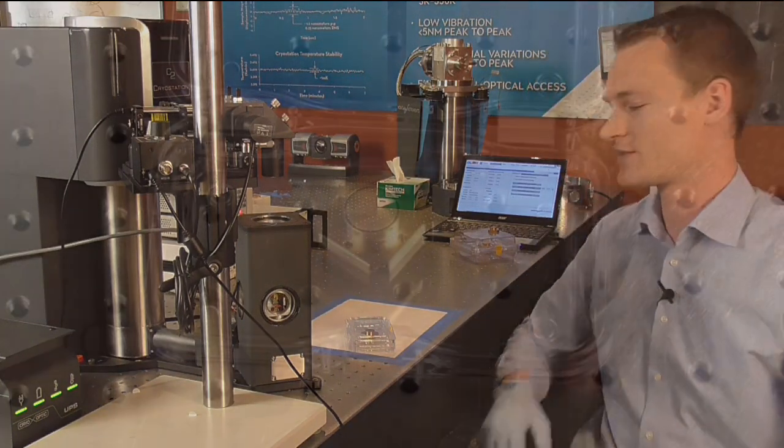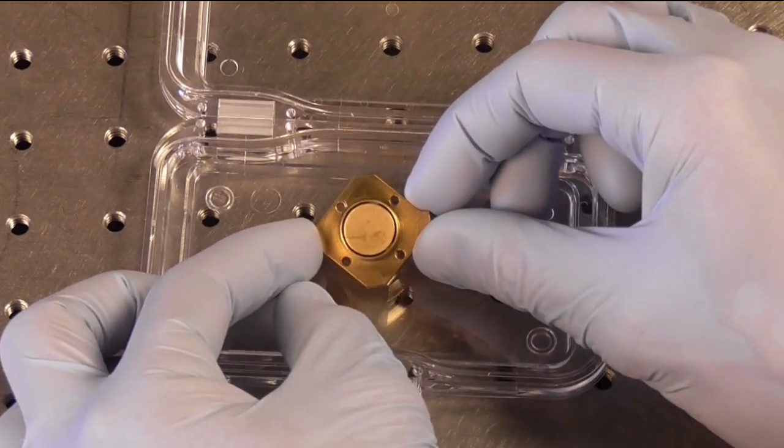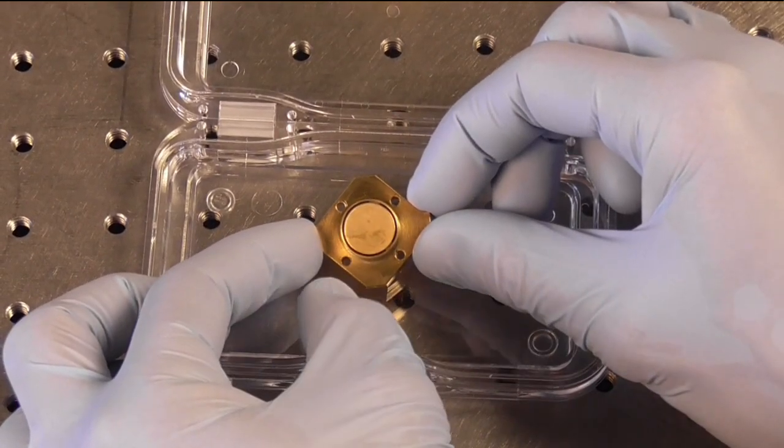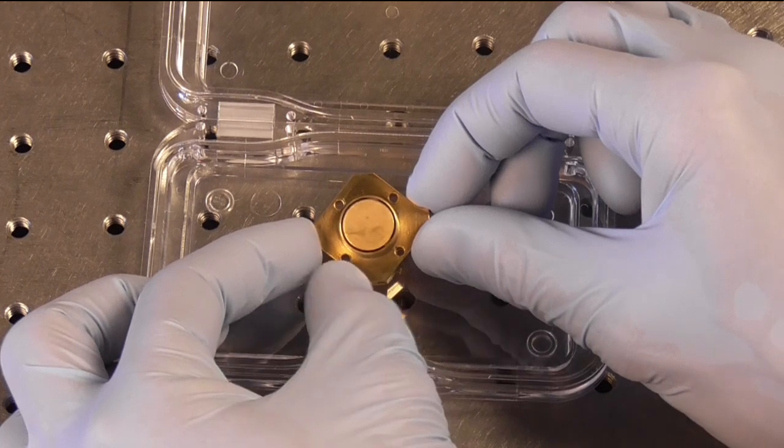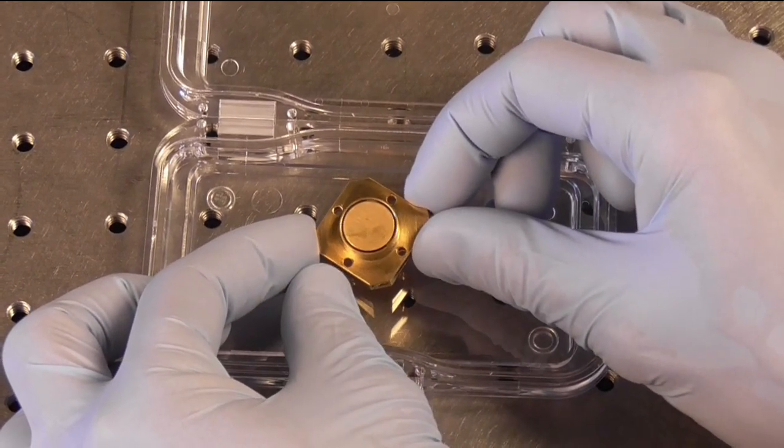So let me show you what the Agile Temperature Stage looks like. Here you see the Agile Temperature Stage which has a sample platform of just over half an inch. Surrounding the platform you see the radiation shield, which stays within 10 Kelvin of your base temperature over the full temperature range of the platform.